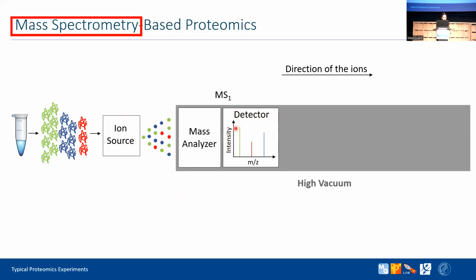First of all, it looks something like that. Let's pretend that it looks like that. But it's actually, for a specific retention time, a 2D plot. And as you can see here, the x-axis is the m/z values, and the y-axis is the intensity. And the intensity should be proportional to the amount of your analyte.